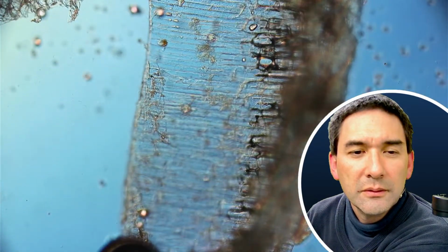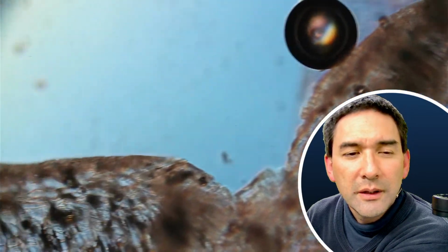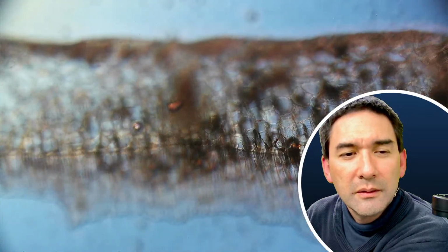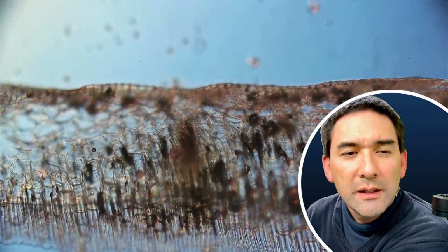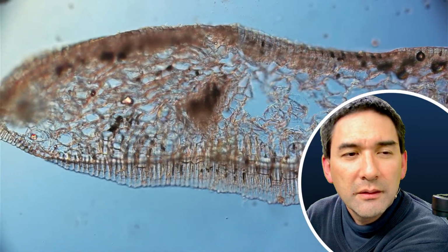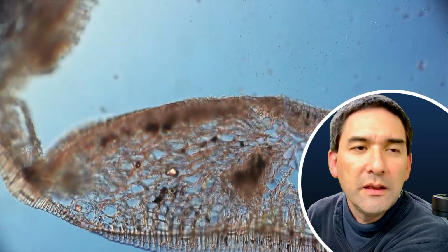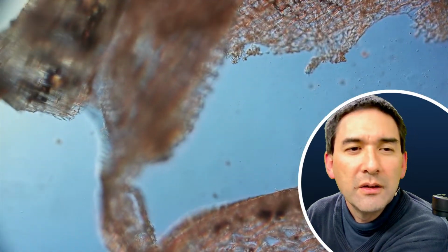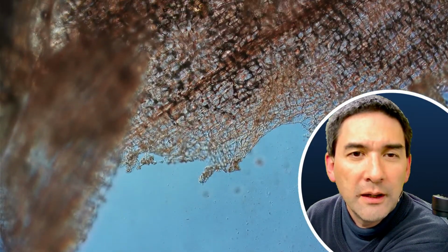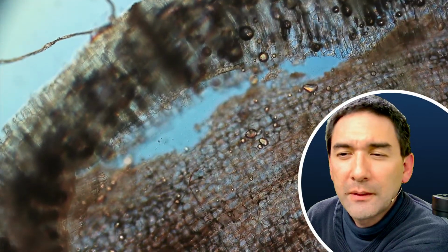So, some air bubbles. In any case, it does demonstrate that I've done this very quickly. It does demonstrate that I'm able to make relatively thin cross sections this way. Again, if you want to have better quality, you have to try this more often, but now, just for the sake of the live stream, I'm doing this quite quickly.